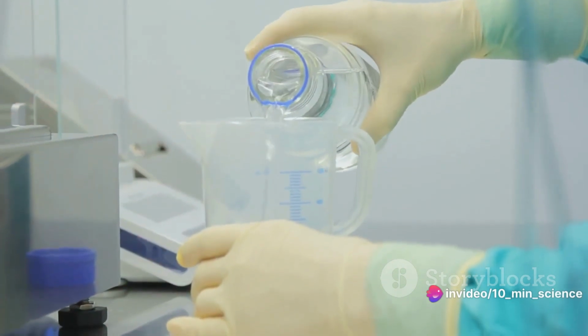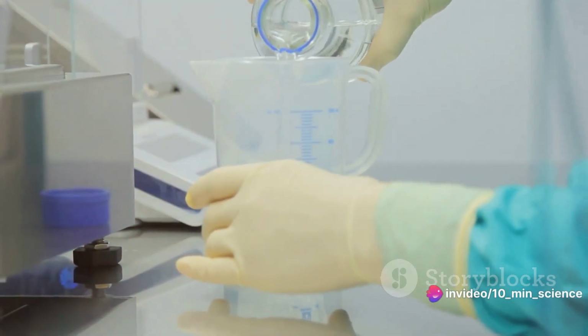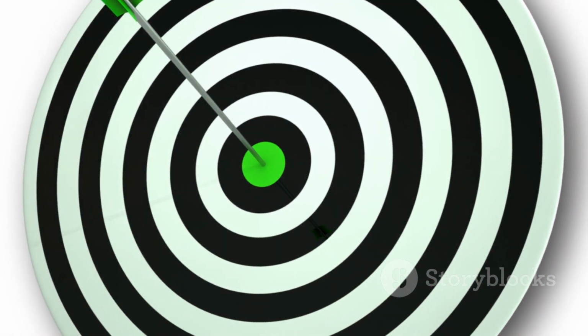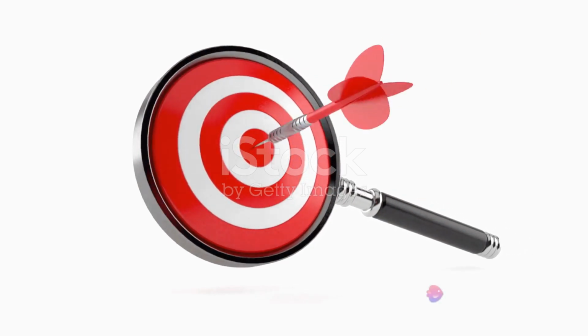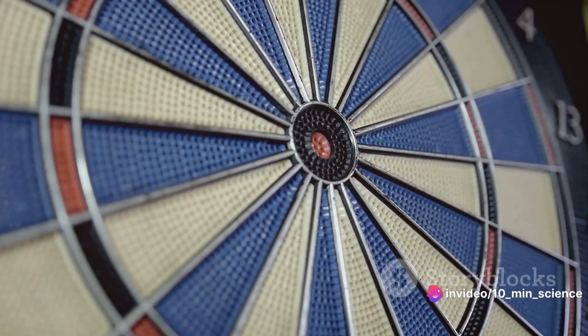We learned that these are substances of known concentration added to our samples that help to account for any variations during the analysis process. They are like the steady hand guiding the ship amidst the turbulent waves of potential analytical errors, ensuring that our results remain consistent and trustworthy.